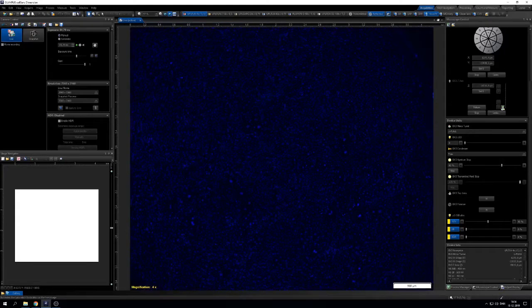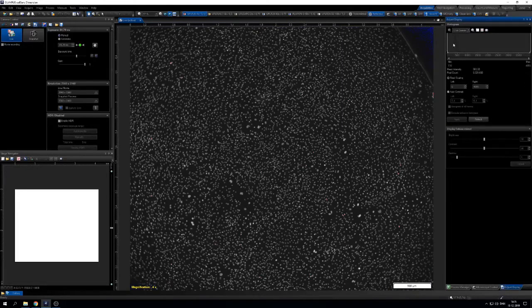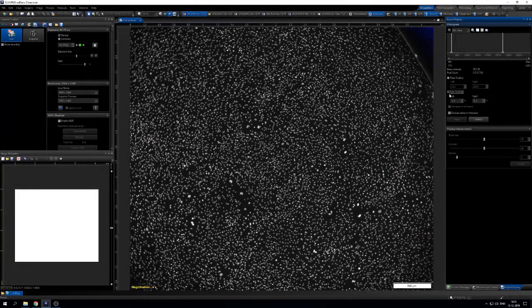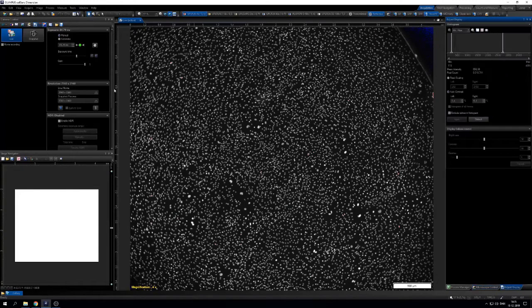And I see low magnification, 4x, of my cells. When I click to the right side of the software again, I see my histogram, so I can adjust the display. Using autocorrection, it clips 0.1% of the darkest and the brightest areas, so I see a good signal.